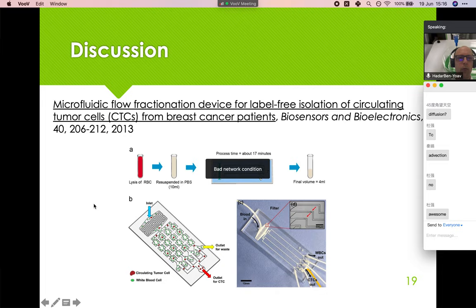Why? I mean, it's a very cool idea where it could work. What could be the problem or challenges for that? Purity. I guess you mean that sometimes, although you want to separate the CTCs, you get some white blood cells. That's correct. It's not 100%. Eventually, you will not have a fluorescent microscope to quantify the cells. You will accumulate the cells and just count them, so you will not know which one is which, and you will address all the cells as CTCs. And you're right; we saw that some of them were even other types of cells. So purity is indeed a very big challenge.